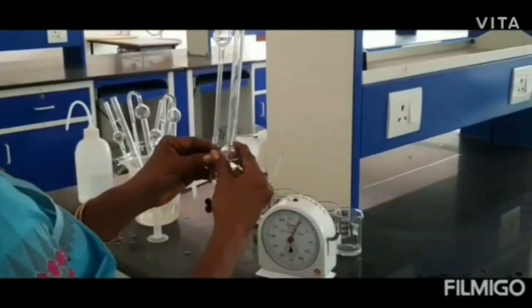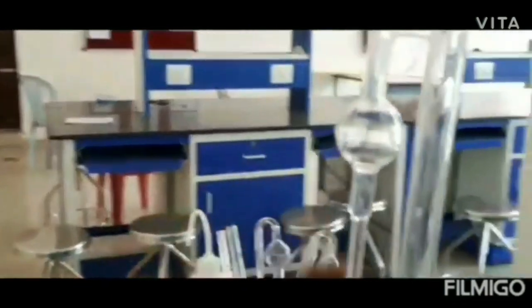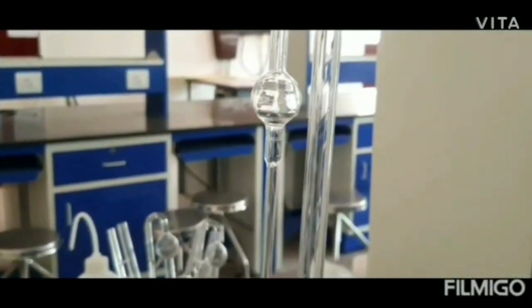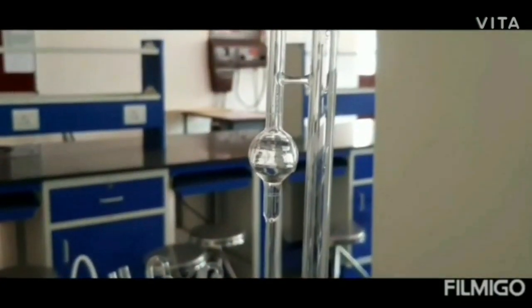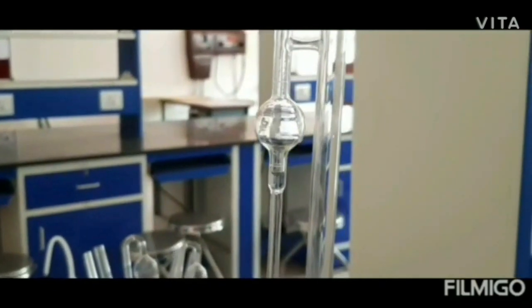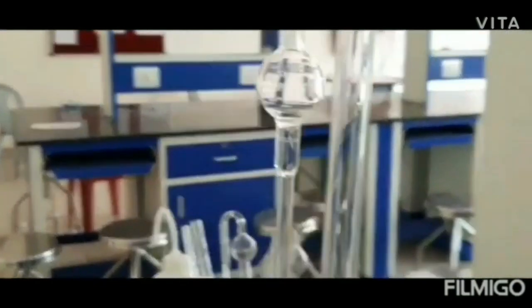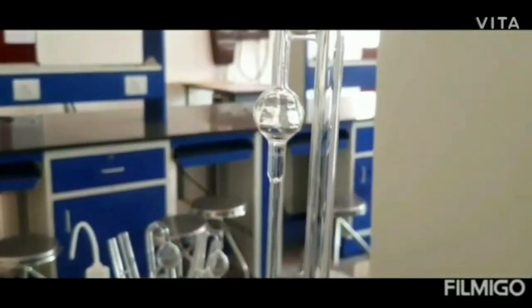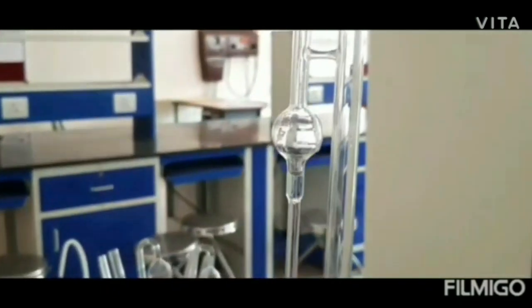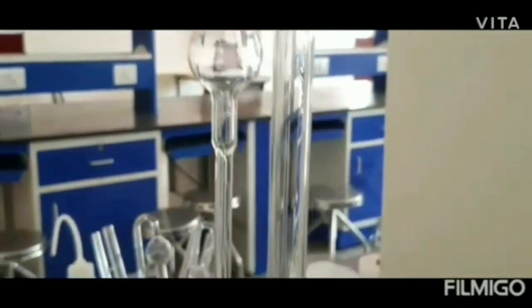Until then we have to hold the viscometer straight. We should not shake the viscometer. We should not disturb it. When it reaches the lower marking, at that time we have to stop the stopwatch. The same way we need to find the flow time for all other concentrations of polymer solution. Okay, and then we need to tabulate.